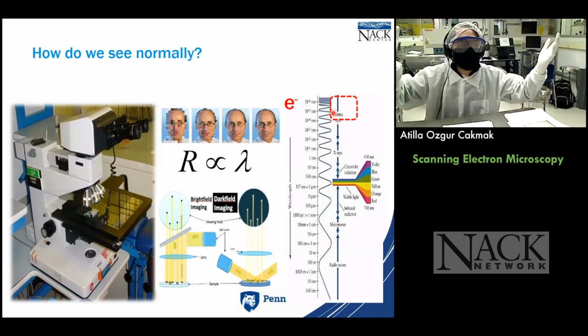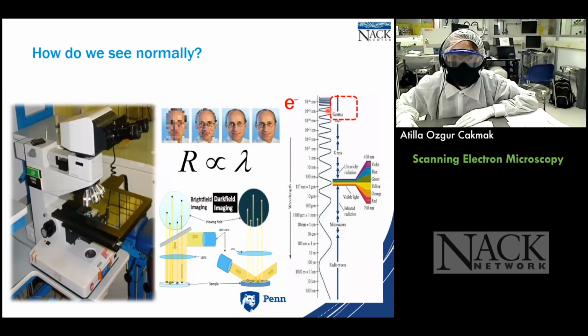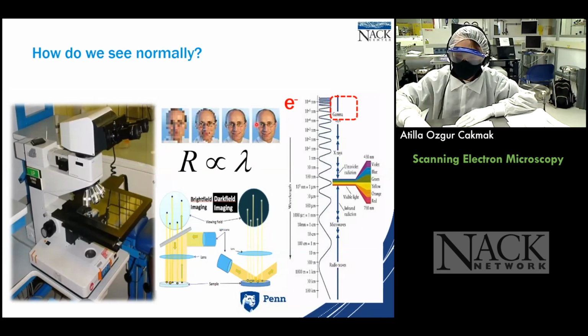So that's Quantum 101 for you, the whole course. They also demonstrate wave phenomena, and they have these sinusoidal patterns themselves. What's really different is, since the wavelength is small, the resolution that we will get will also be small. The capital R will be small. So we end up with a much better, finer image in the end, thanks to that.